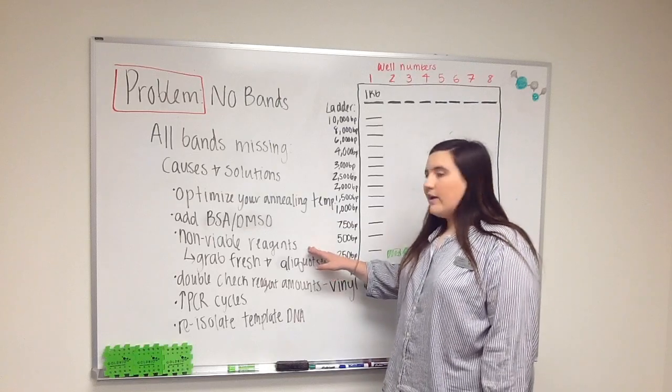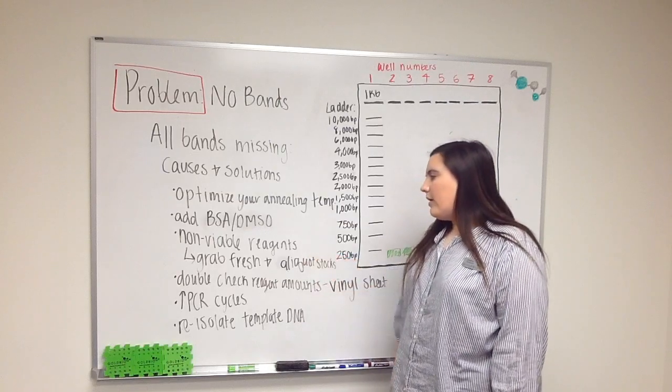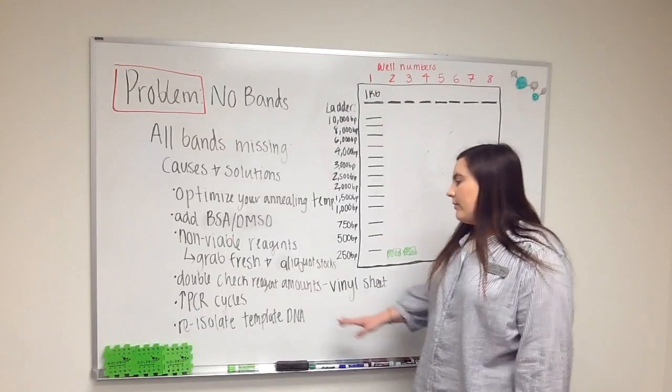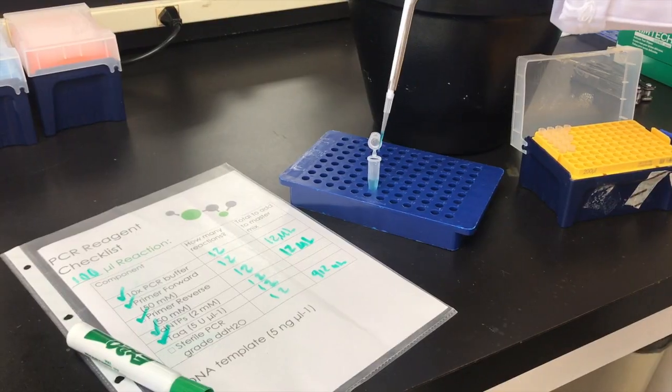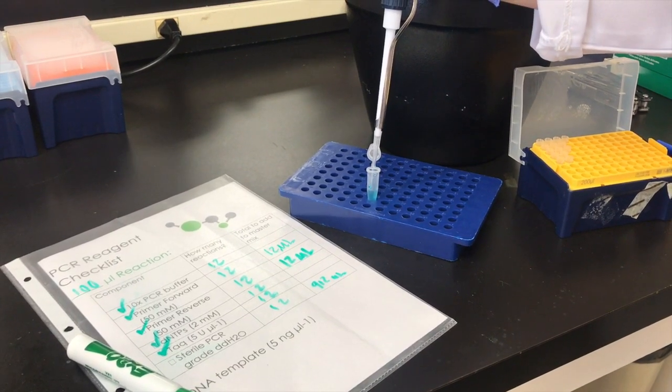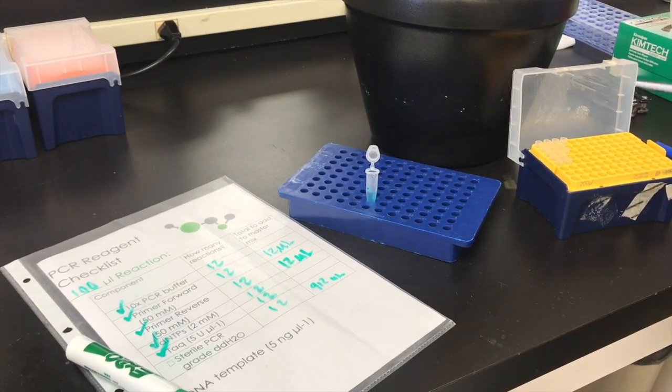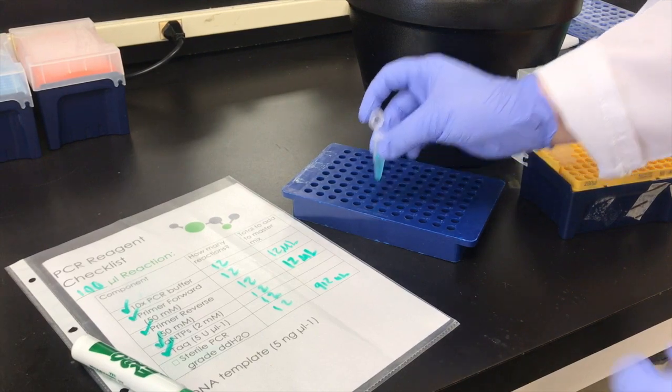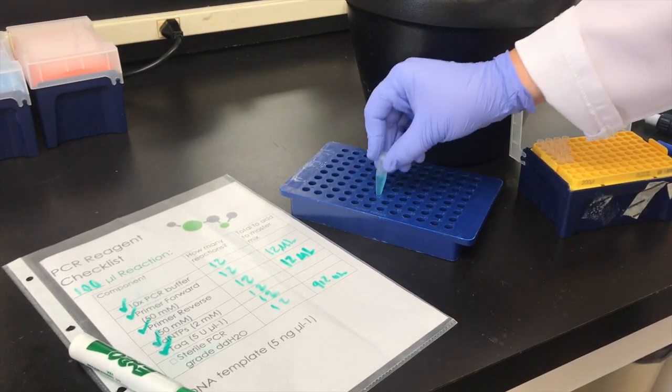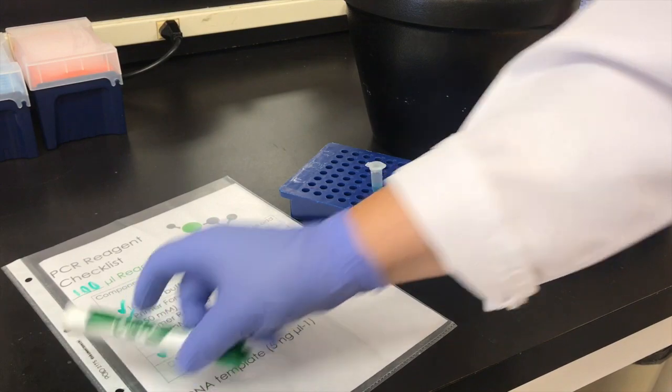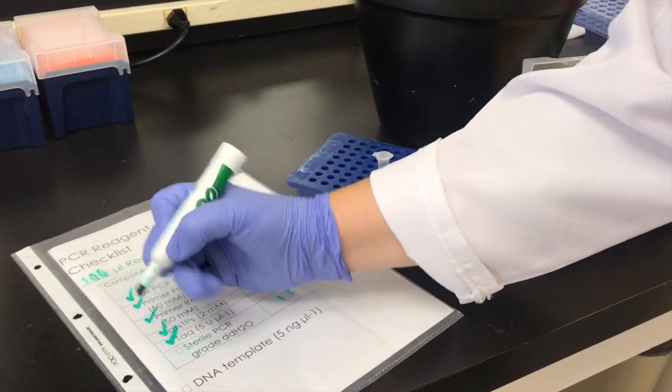You may also have reagents that aren't viable. Go ahead and grab fresh reagents and try it again. Double check your reagent amount with your protocol. Try typing out your protocol and leaving it on your bench in a vinyl sleeve. You can then use a dry erase marker to check off the reagents as you add them and erase them after you're done. That way you're consistent with the amounts you're adding each time and making sure that you added all the reagents correctly.